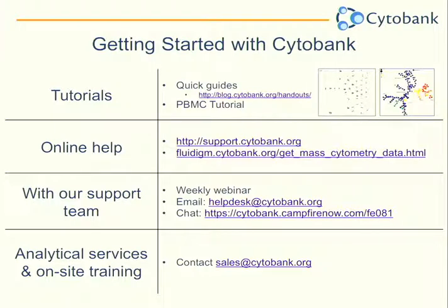If you're interested in getting help online and just reading about Cytobank, we have our support portal, which is basically a giant FAQ with any question you might have. It has a lot of answers within there as well as the Fluidigm Cytobank link there, which has more mass cytometry relevant examples. In addition, our support team, Jeff's over there, who's part of our support team. Some of you might have interacted with him before. We have a weekly webinar, which Jeff often gives, and so does Chris, where we do it live every week.